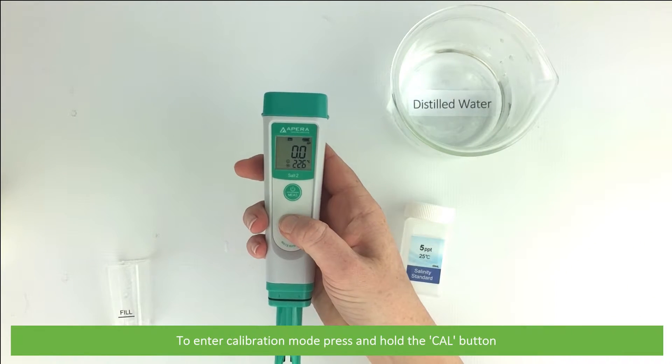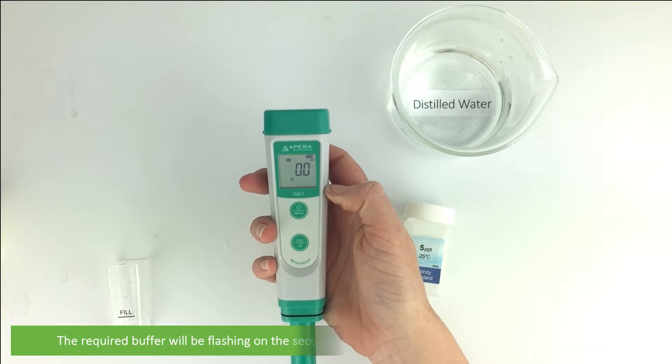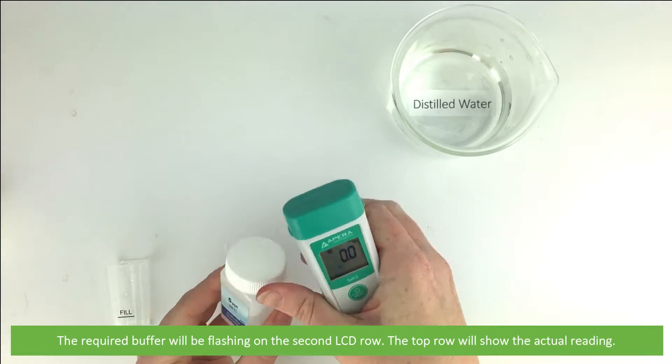Then to enter calibration mode, press and hold the CAL button. The required buffer will be flashing on the second LCD row, and the top row will show the actual reading.